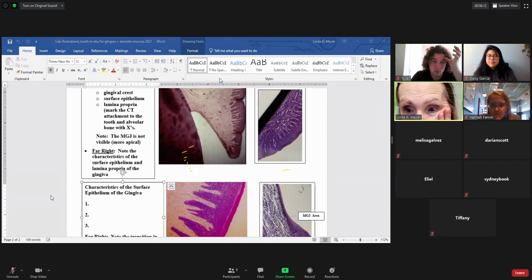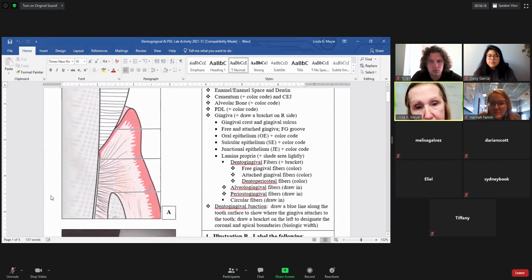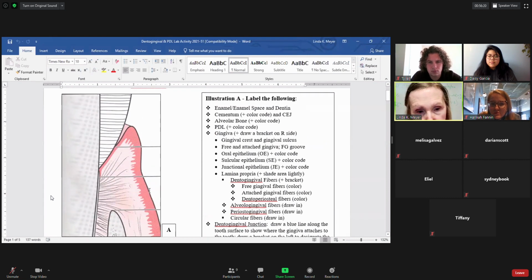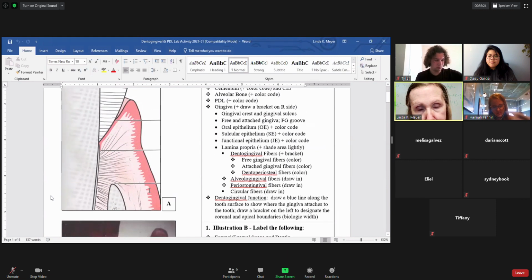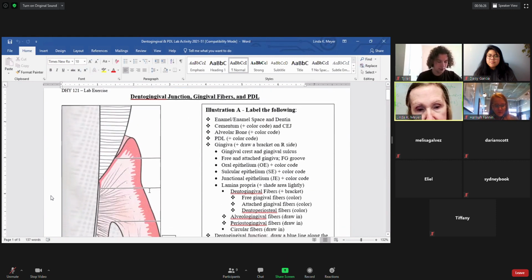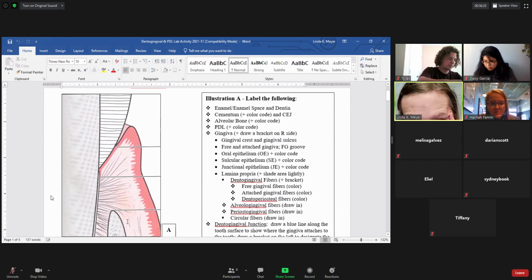But we are going to go ahead and do this picture. So this is actually a close-up of what you did for the pre-test, or the lab ticket, I mean.